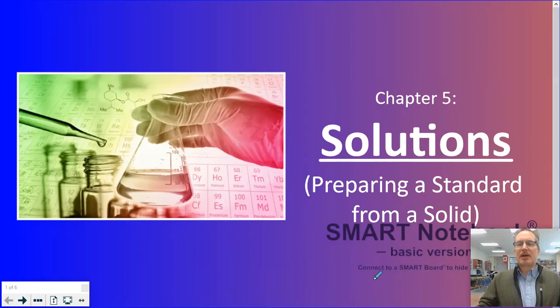Good morning, Chem 20s. My lesson today is going to be preparing a standard solution from a solid.